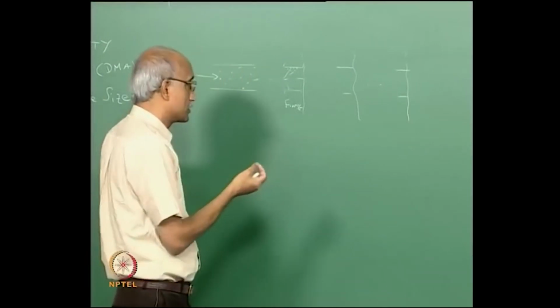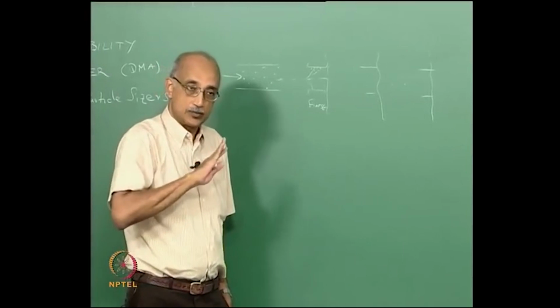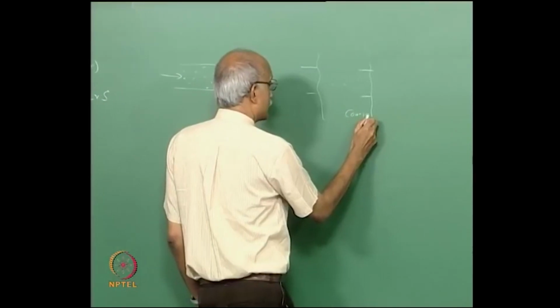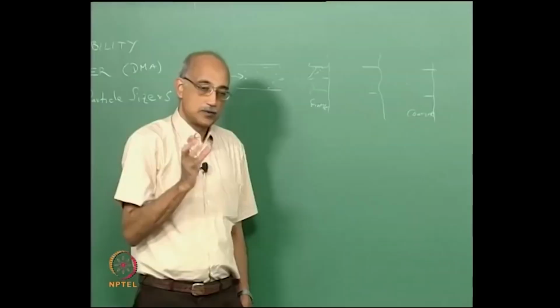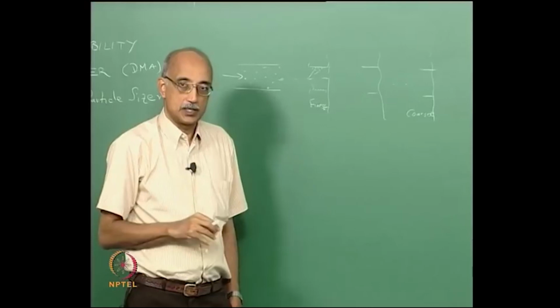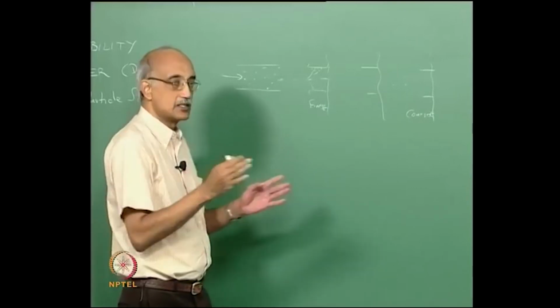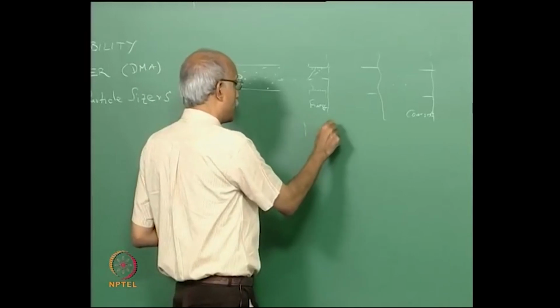The coarsest particles will have the smallest diffusion velocities, and they are most likely to follow the streamlines of flow. So, essentially if you look at this last screen in this diffusion cell or diffusion battery, it will have a predominance of the coarsest particles in the fine particle size range, and therefore it will get captured in the last screen. So, what you have effectively done is a classification by size, and there will be an enrichment of particles.